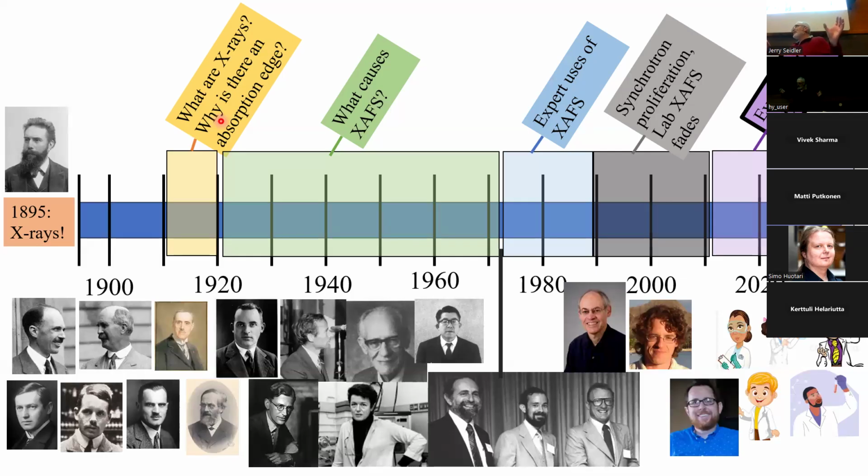And then in between there is just expanding the scientific reach. From a technological perspective, more flux is always nice, better optics is always nice, operando cells are outstanding. But to me, the really interesting stuff is on those two endpoints, which is instruction, so the technique can be used by everyone who actually does need it, that they'll know it exists, and then possible industrial use in very analytical ways.